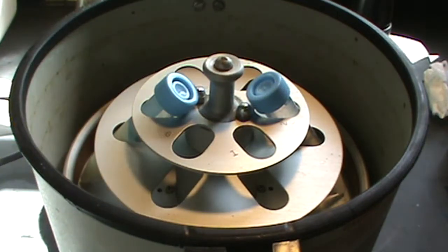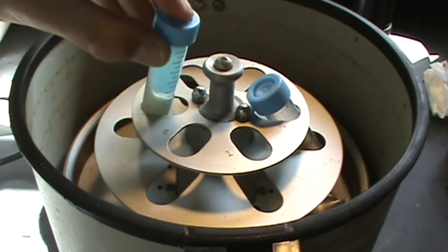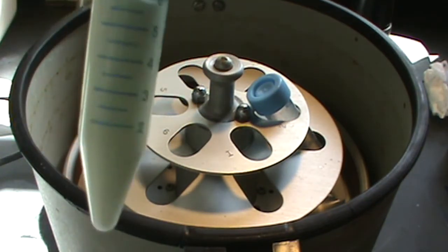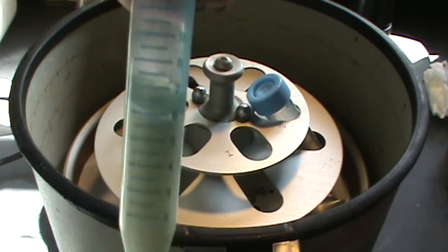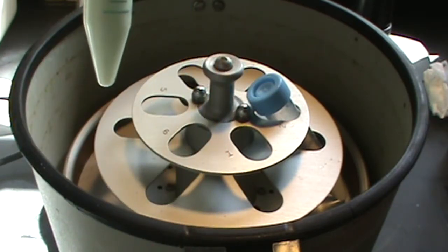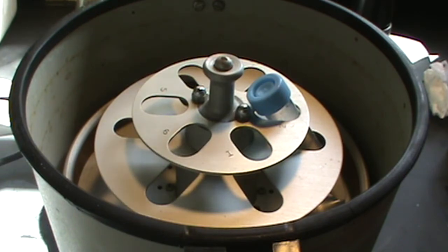The supernatant solution is pipetted off, replaced with distilled water, shaken thoroughly, and then returned to the centrifuge. This process is repeated three times to wash the precipitate.